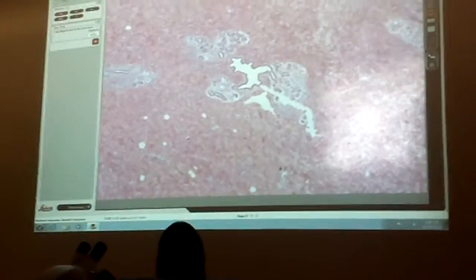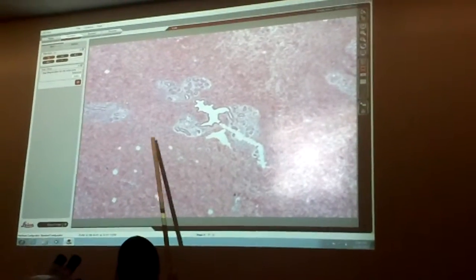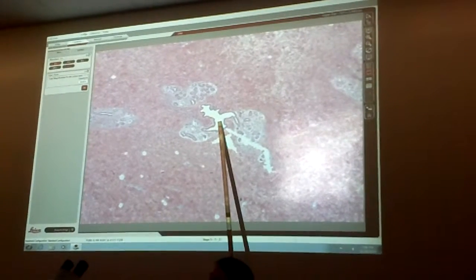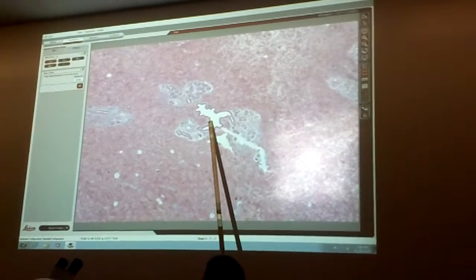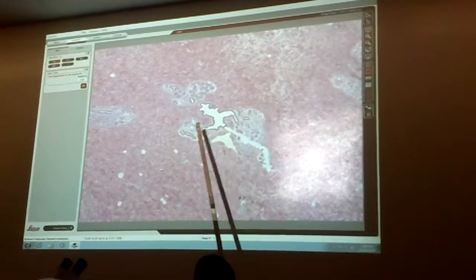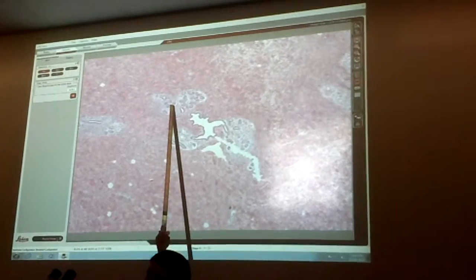Interlobular connective tissue. So again, the main background, all over here, that's the interlobular connective tissue. All of this stuff. Okay. This is a lactiferous duct. Circle of cells, or a complete round of cells, lactiferous duct. Now this whole area right here, this whole thing, this whole thing, those are lobules.